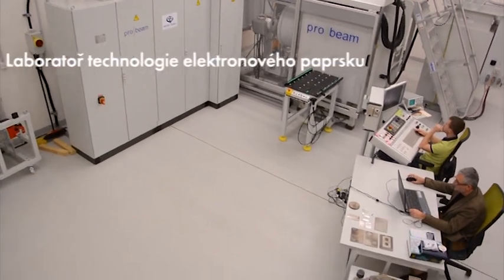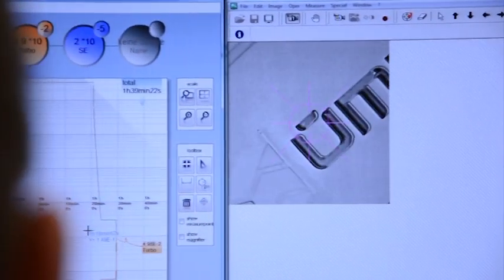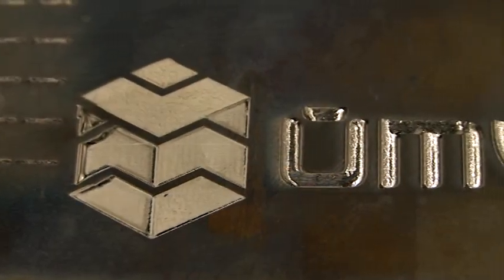Laboratoř elektronového paprsku vznikla v rámci globálního projektu NETMI s přispěním Evropské unie jako platforma pro pojení Ústavu materiálových věd a inženýrství a průmyslu České republiky.